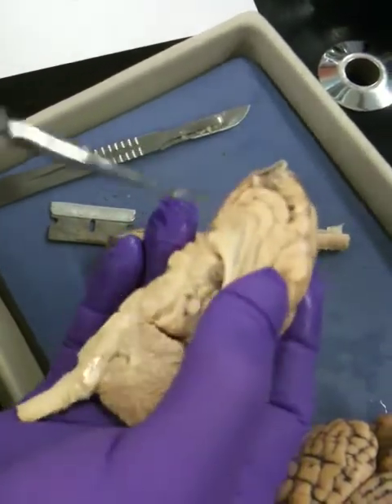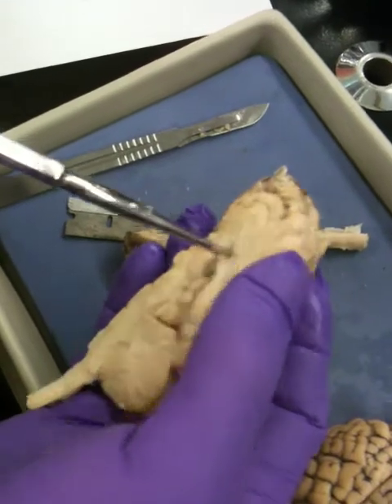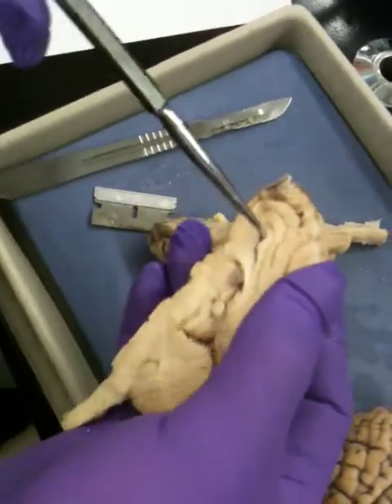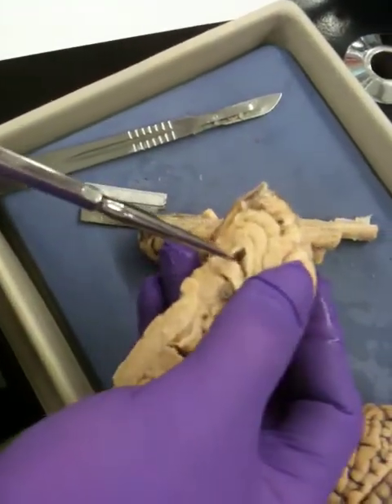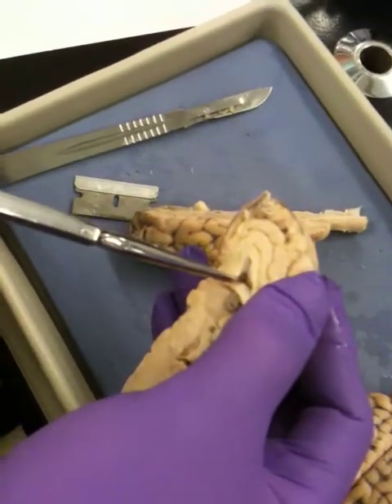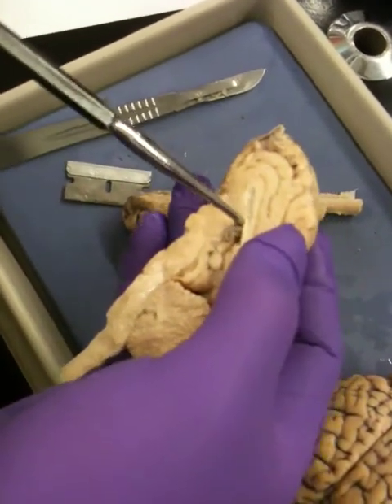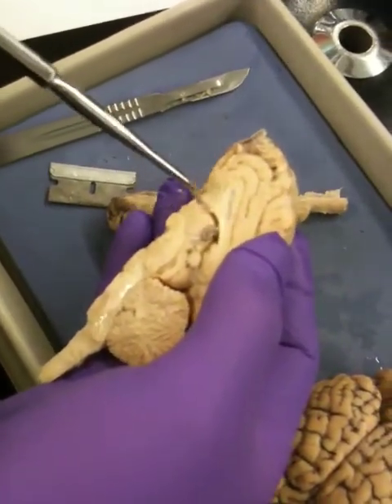So those cavities, one is behind this structure. This is called the septum pellucidum. I don't think I asked you to find that, but you'll see it in the book, since I already cut through it. If you look at it, there's a little cavity there. That's one of the lateral cavities. There's another one here. This is the third ventricle. Actually, the third ventricle is this whole area.